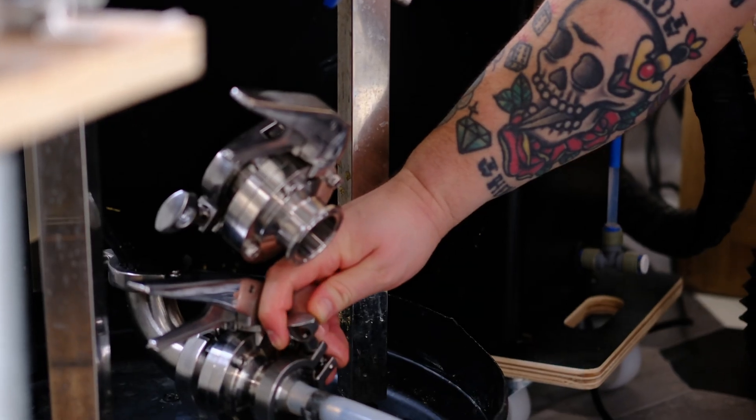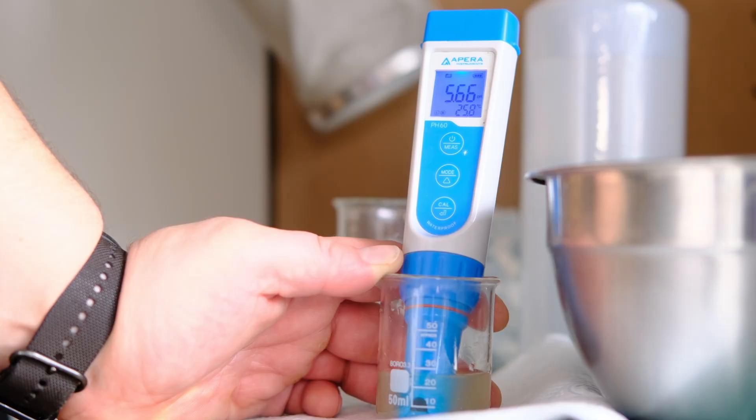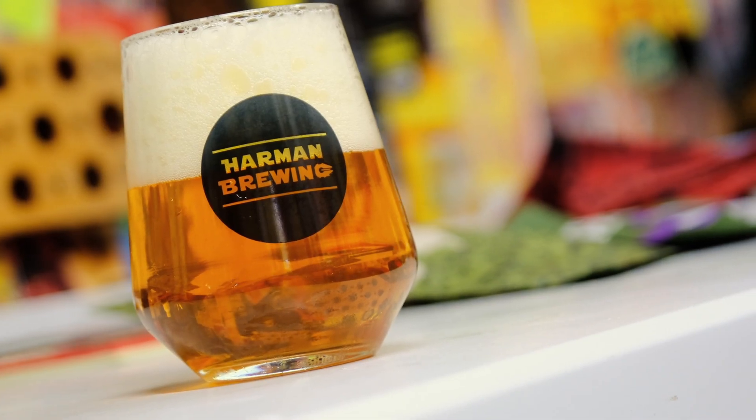In a lot of our recent videos we've talked quite a lot about using pH meters in the brewing process to really make sure that you nail your mash pH. When we went down to Cornwall recently and filmed with Verdant, one of James' top tips for home brewing was to be taking pH readings right throughout as many steps of the process as you can. And also when we filmed with Radim and Brett as part of our Brew With You series, they were also taking pH readings of their mash to make sure they were within spec to get the best out of their mash.